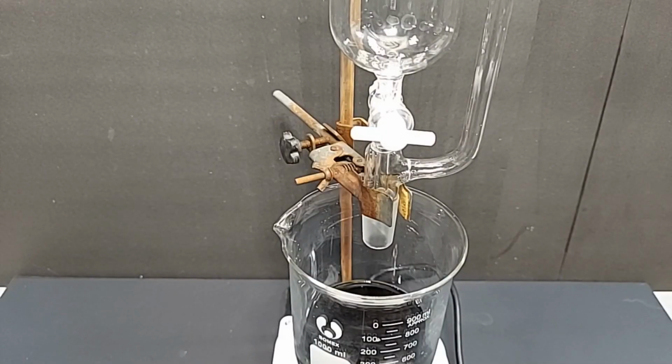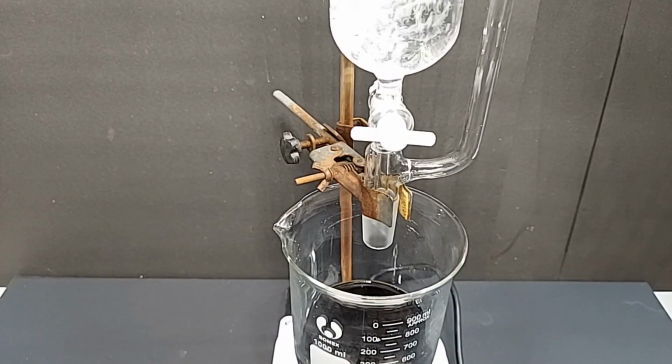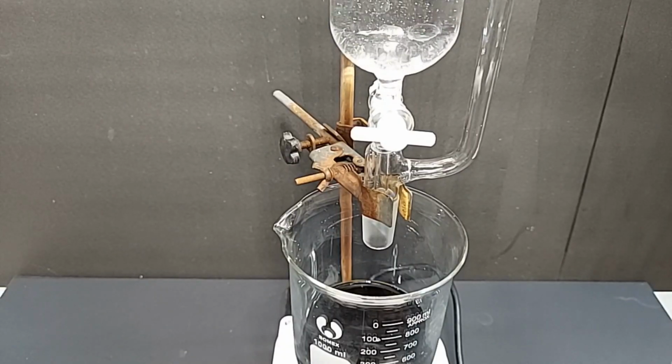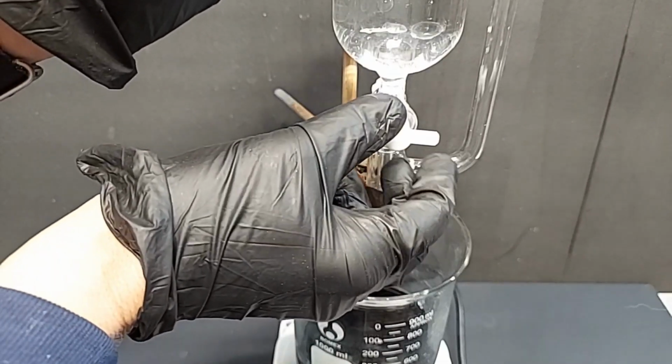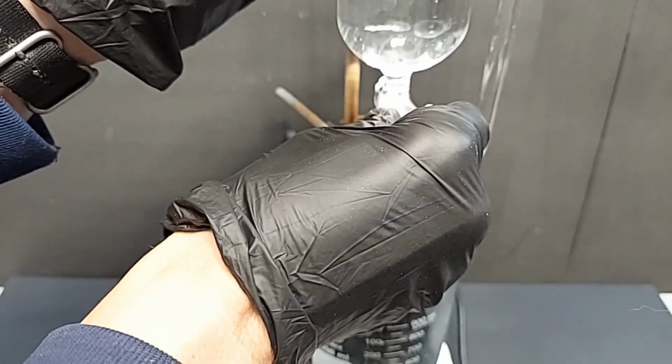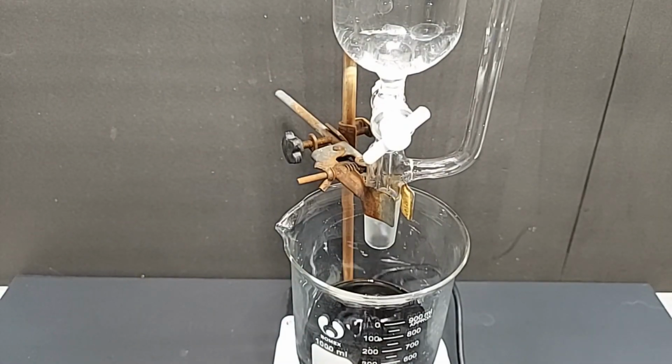This is simply an addition funnel I have here over the 320 milliliters of solution, and I'm going to add the 320 milliliters of water right now. Gosh, so difficult. I'm going to be stirring this, of course, so I'm going to turn on the magnetic stir here, and then just start a very slow drip rate. Doesn't have to be terribly slow, but just slow enough that we don't overdo what I'm trying to prevent, and that is putting too much water in too quickly. There we go. It'll take time, but patience is key here.